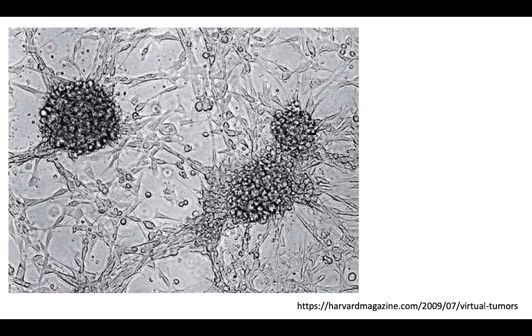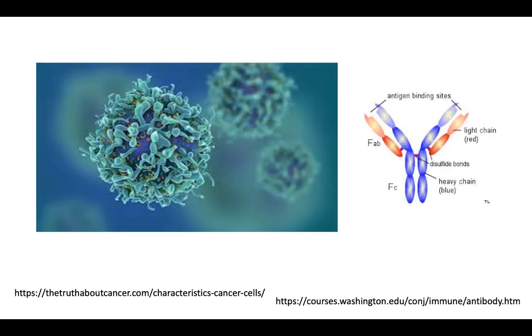So right here in front of me are just a few cancer cells. I just downloaded these images from the internet. It's one of the images that I like. And the idea is that one would use a flow cytometer to look for certain marks. One of the main applications of a flow cytometer is to look for certain marks on top of tumor cells or any kind of cell, as a matter of fact.